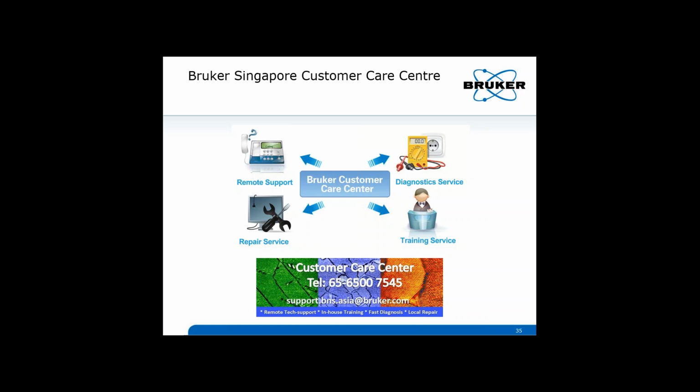Okay, we have more questions coming. What kind of tip should be used for hard disk, which uses magnetic media and DLC coating?